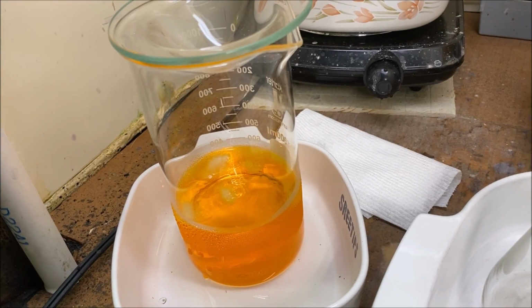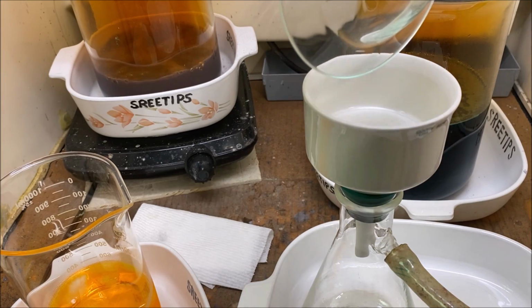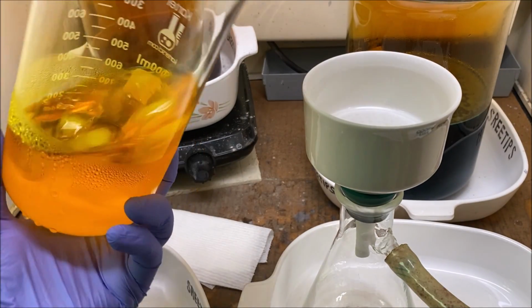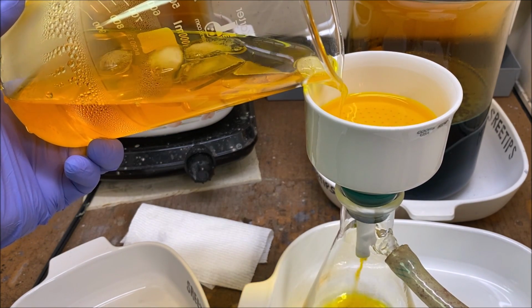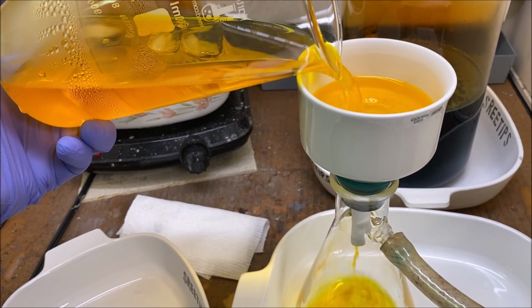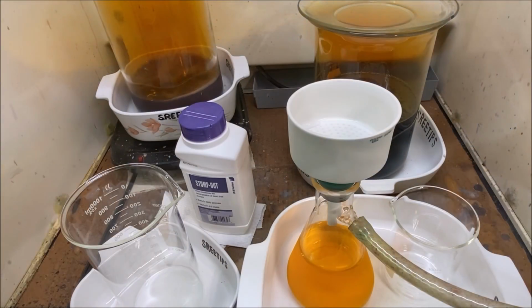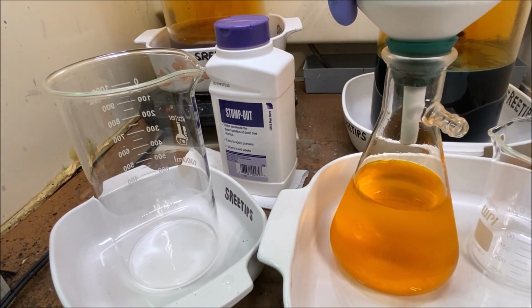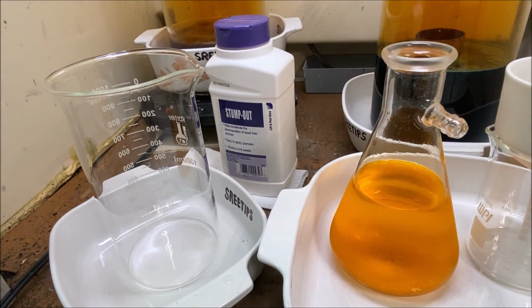I've got the gold chilled down with some ice. Now what we'll do is filter it out. Got everything filtered out. Now what we'll do is transfer the solution to our beaker.